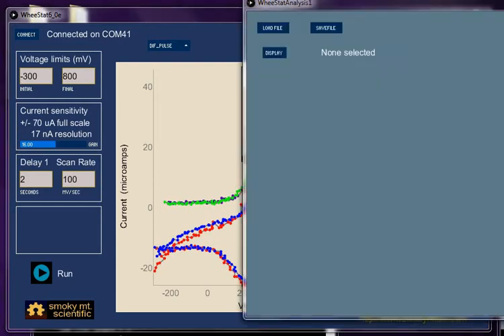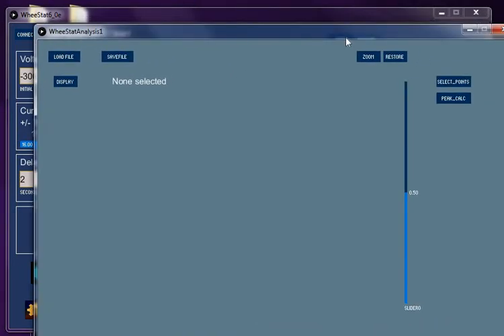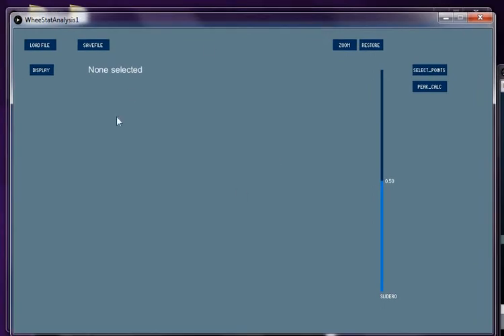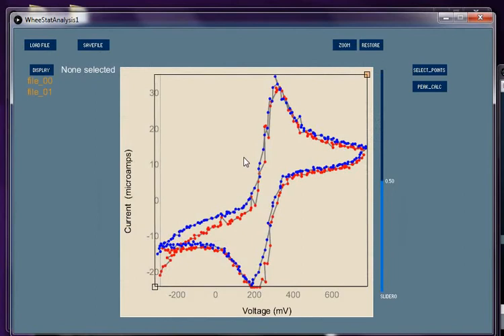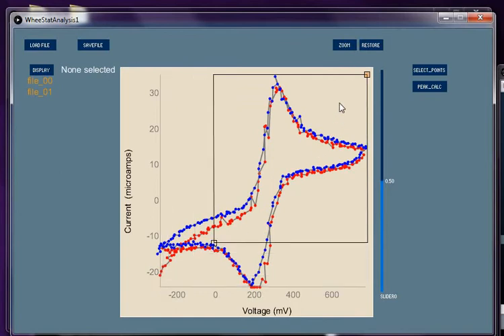So those have been saved and I'm going to bring over our analysis tool. This is a separate user interface. We're going to load the data and you can currently only load data that is of the same data length. So we've just opened our two cyclic voltammograms. Once again we have the box here that we can change the size of and select some area to zoom. Let's hit the zoom to show that we do zoom, we can restore.